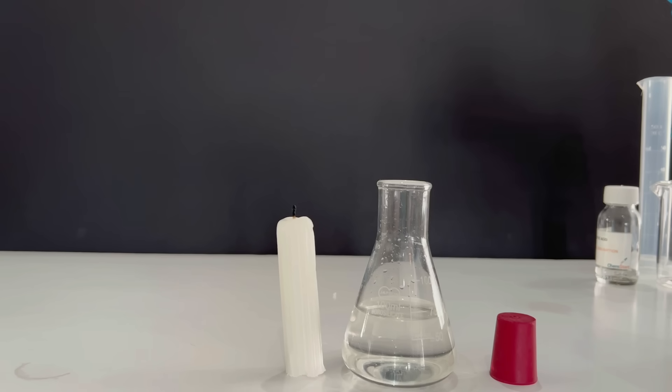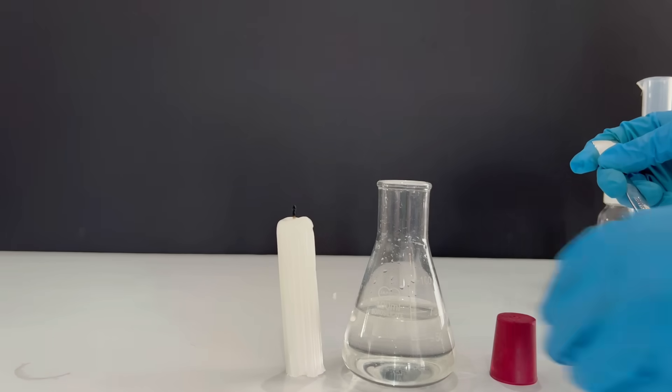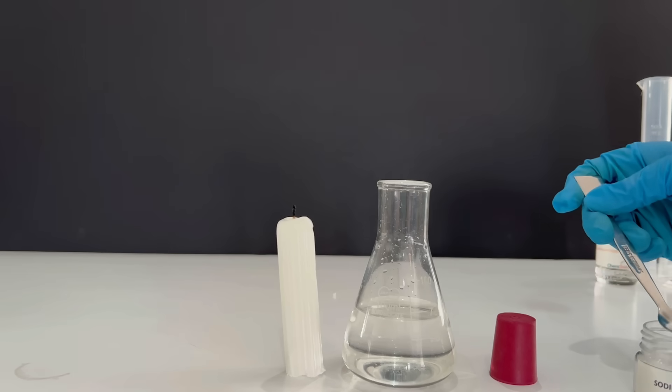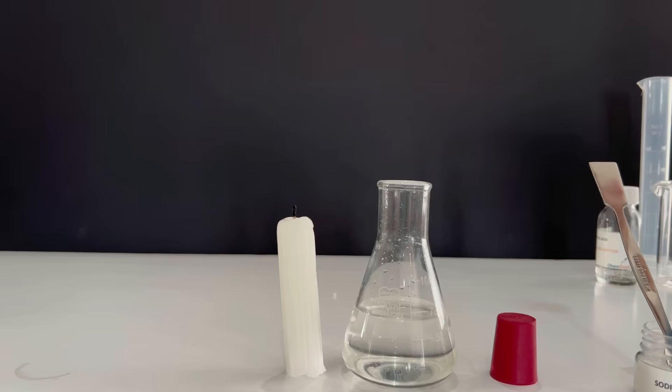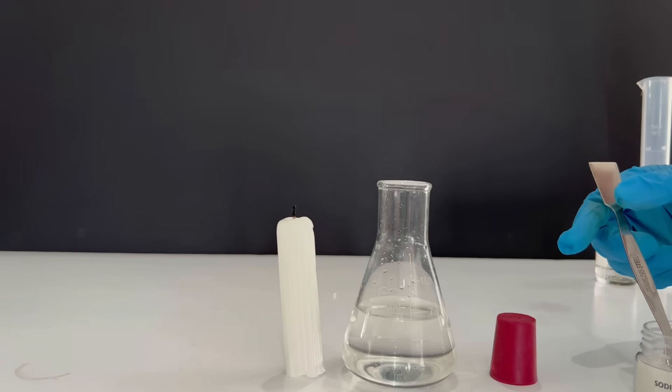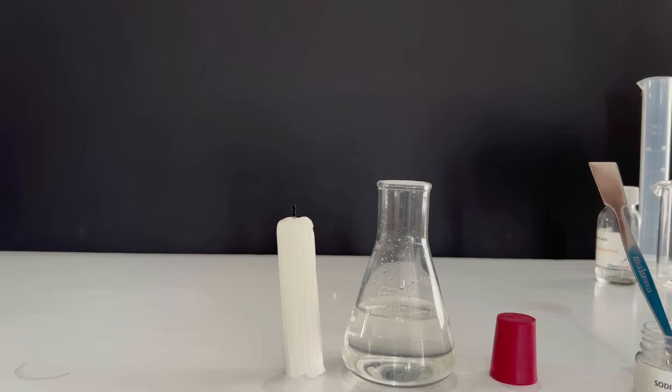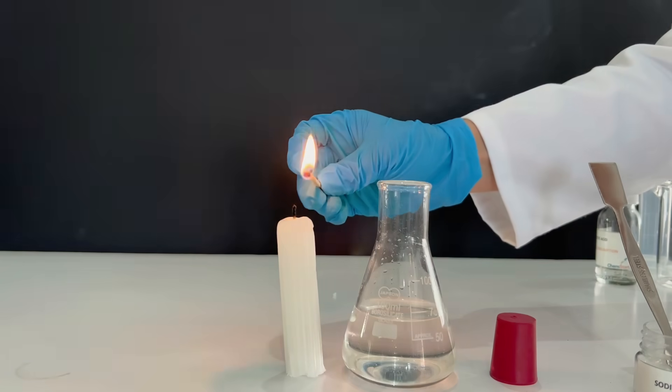We'll measure out half a spatula of sodium bicarbonate and hold the stopper close by, because as soon as you add the sodium bicarbonate, you have to add the stopper directly after that. Otherwise some of the carbon dioxide will escape and we need as much of the carbon dioxide as possible. Let's light the candle.